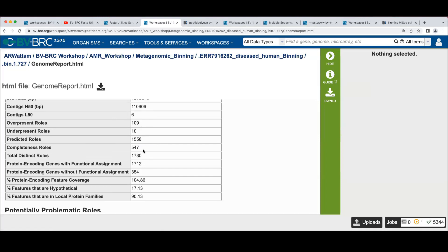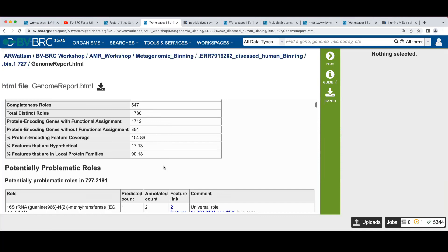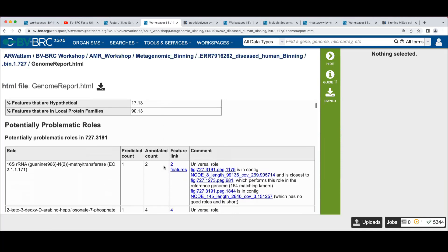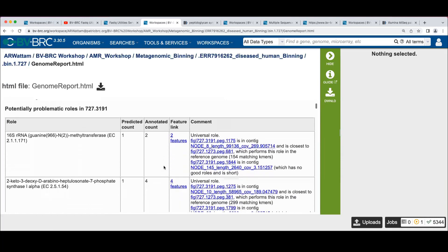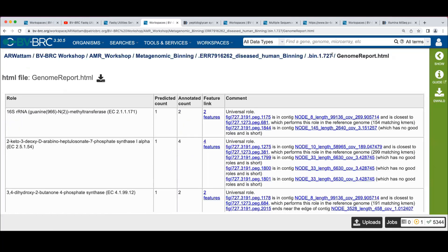And we predicted a total of 1500 roles. 547 of those were used to calculate completeness. We had 1730 total roles and some more statistics there.